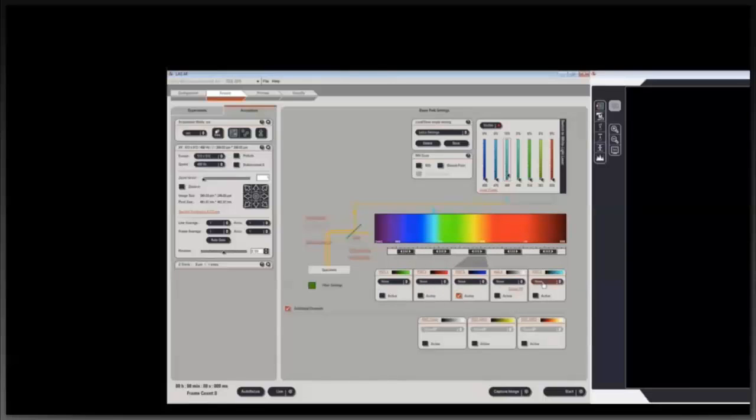We now have a number of different detectors that we can use. As I've said before, the PMT, which is a photomultiplier tube, we have 5 different PMTs on our system. We have 1, 3, and 5, which all have the same specifications for normal confocal imaging. PMT2 we have for FLIM in particular, and we have a HyD detector in position 4, and this is specifically for STED. It's a highly sensitive detector, and it allows us to do gating.